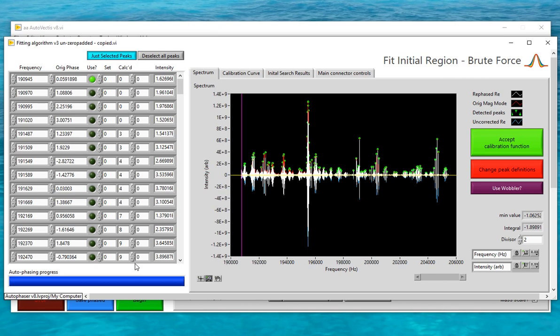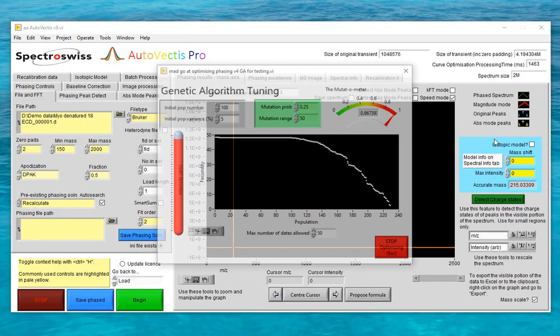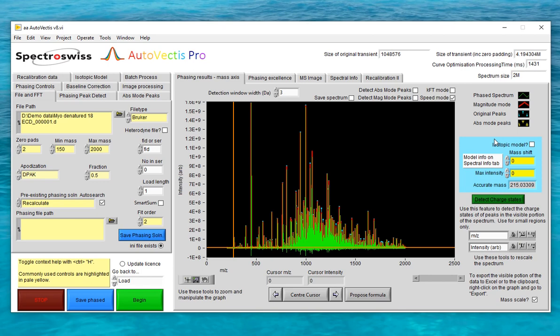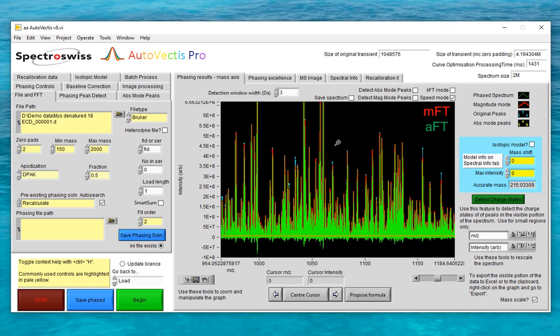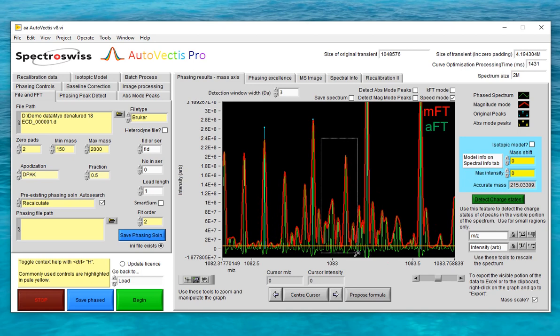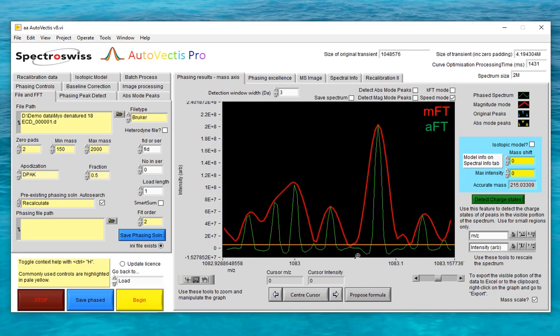The reason I've explained that now is that as you'll see, it all happens quite quickly. You'll spot the genetic algorithm window popping up every time Autovectus is optimizing a phase correction function. But the end result is that the whole spectrum has been phased and the absorption mode spectrum is now shown in green on the screen. So that was the Recalculate route being tried for ICR data, and exactly the same process can also be used for Orbitrap data.